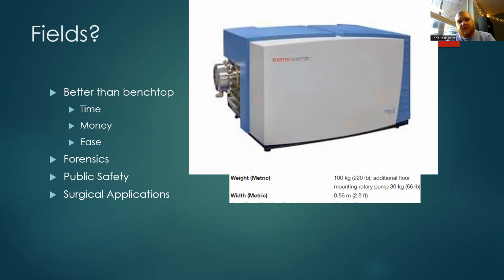I think the commercial use that I'm going to be talking about comes in at roughly 2.2 kilograms. So is that like 5 pounds ish? Somewhere around 5 pounds. So better than benchtop. It's quicker, right? A lot of the times mass spec would be looked at previously as our last place to go. What is our last place that we're going to get? Last place being mass spec, right? So we have to collect this sample, transport it, make sure it goes through all the right processes, chains of command, and then get it into the laboratory where it's then able to be analyzed quantitatively via mass spec.